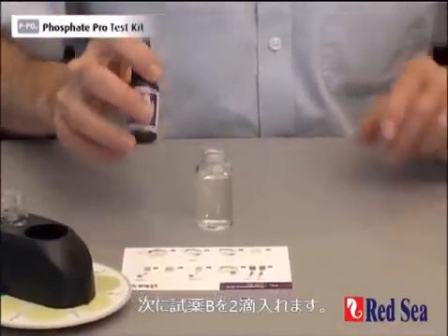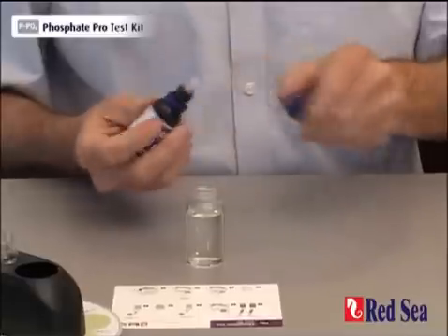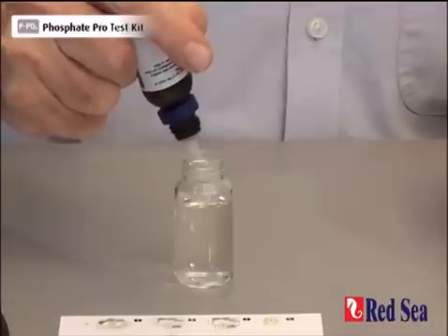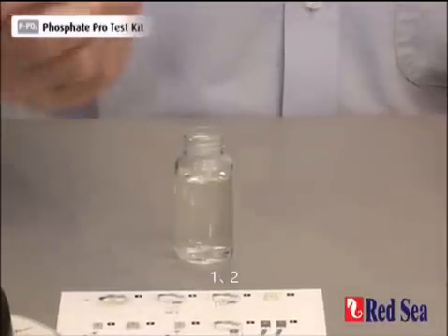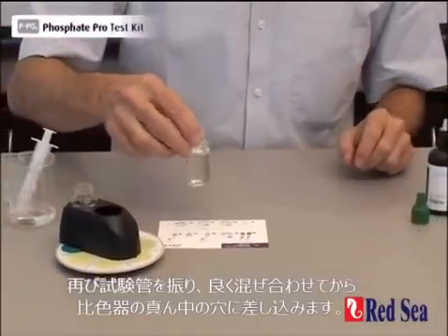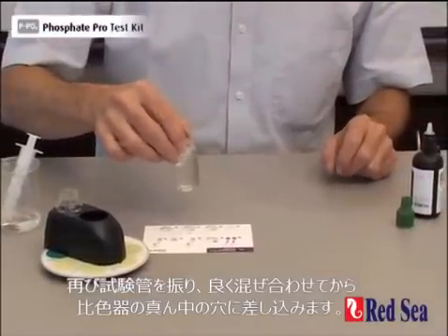And we're now going to add two drops of reagent B. 1, 2. Again, shake the vial to ensure good mixing.